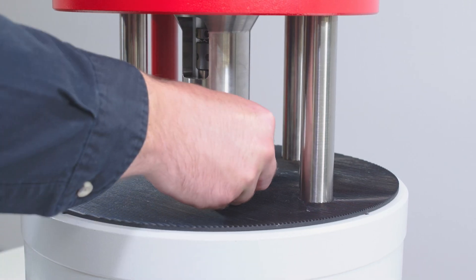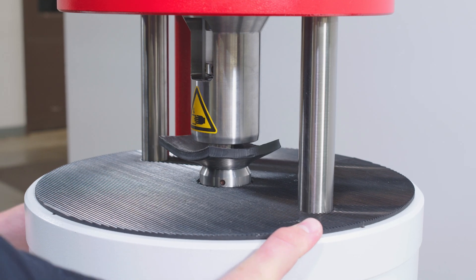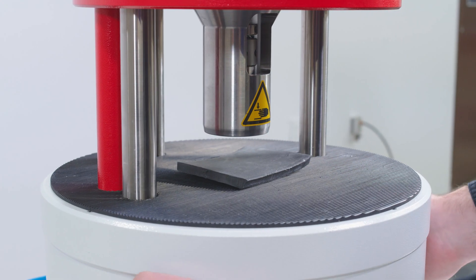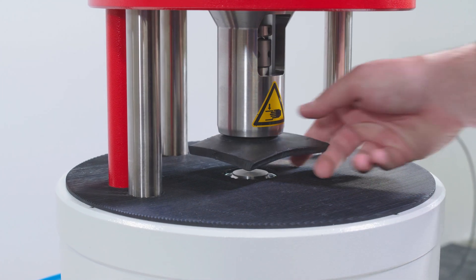Featuring a double action pneumatic system, the RVS first compresses the material to a user defined volume using its compression piston, and then after a set compression time, cuts the sample. The sample volume can be adjusted from 2 to 12 cubic centimeters depending on testing requirements.